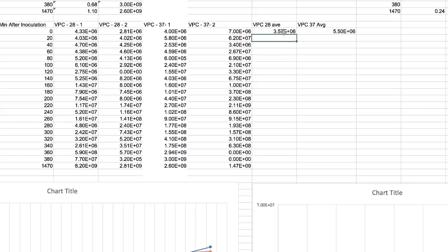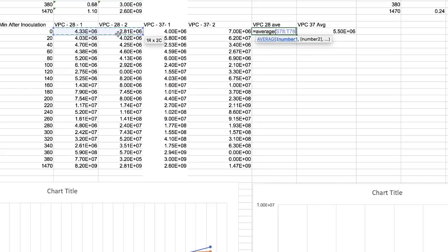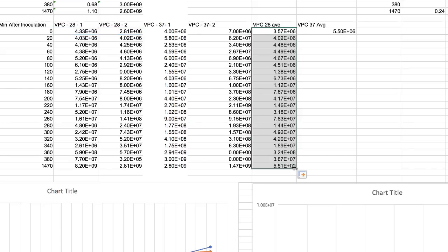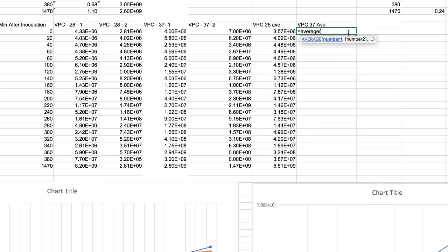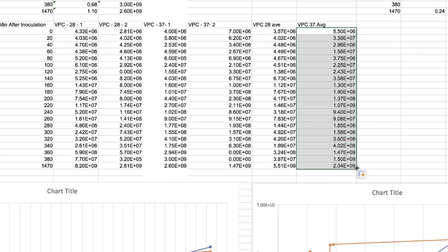To calculate the average of the viable plate count replicates, type equals average, then click and drag across those two values — there it is. Then drag the formula down to fill the rest. Do the same for the 37-degree values: equals average, click and drag the 37-degree values, boom — you've got the whole thing.